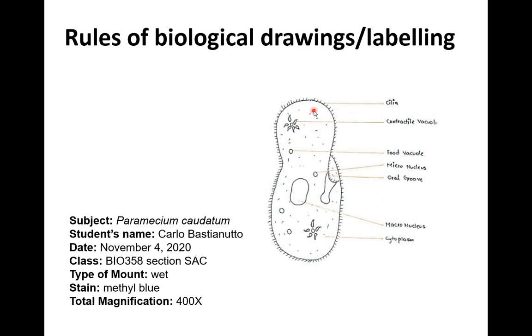And so here it is in terms of labeling. When it comes to labeling, you should always point to what you are labeling, and all the labelings should be done only on one side. You can choose left or right, but they all stay on one side. They should be organized on top of each other in a neat way here so they don't overlap.